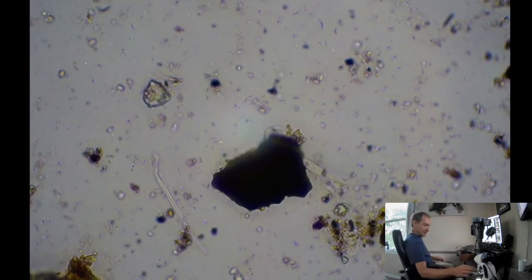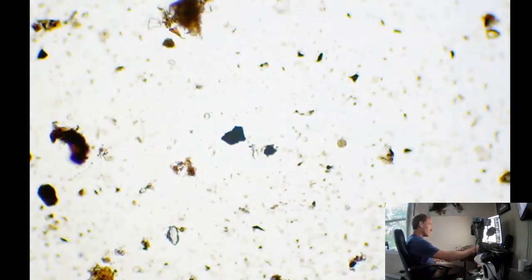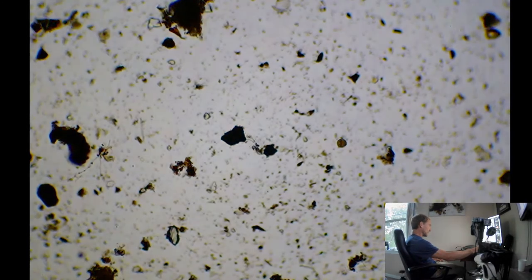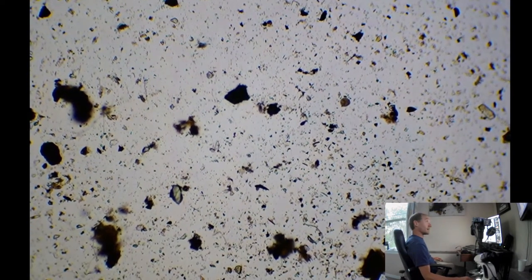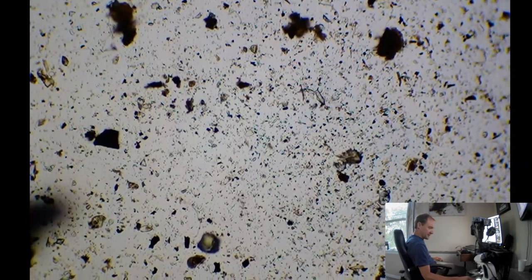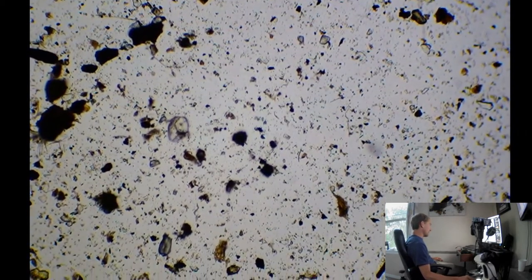Alright, let's see what else we see. That is a big A plus for Dad's soil right there, finding a nematode. That's what you want to see. Alright. Let's get some focus. And anybody remember which way we were going? I think did we hit the top and come back down? Yeah, we're way up at the top, so let's go down. Yeah, we were going down.